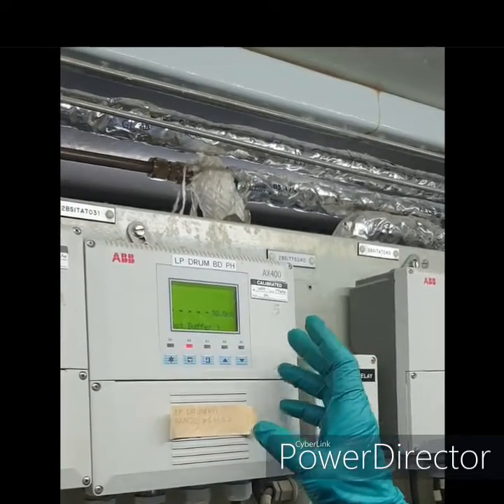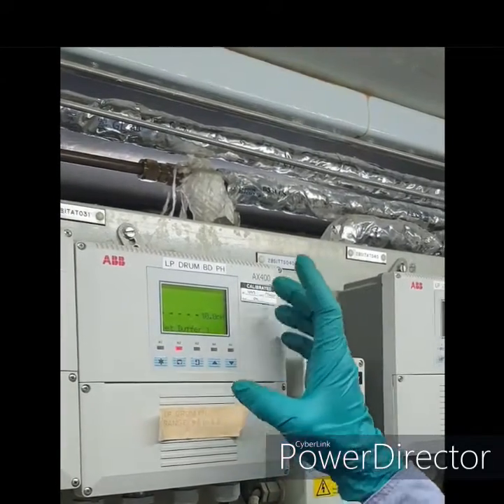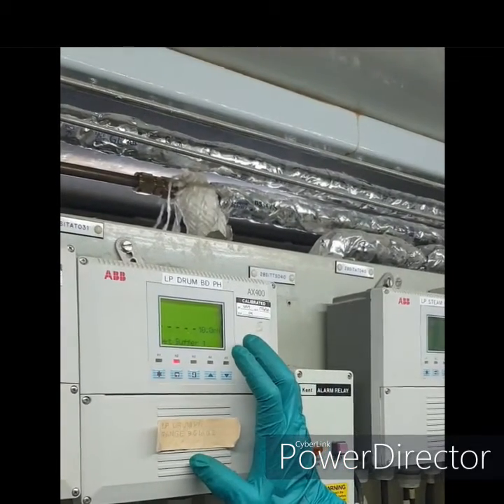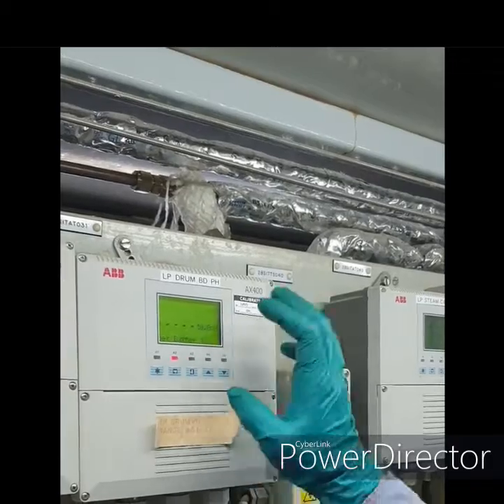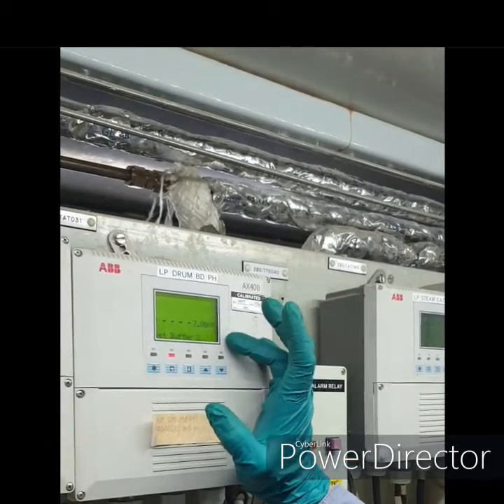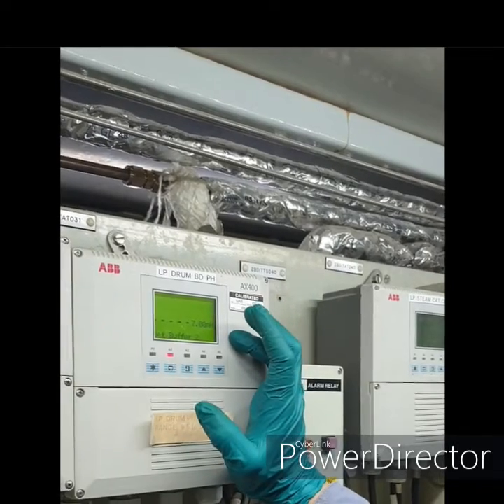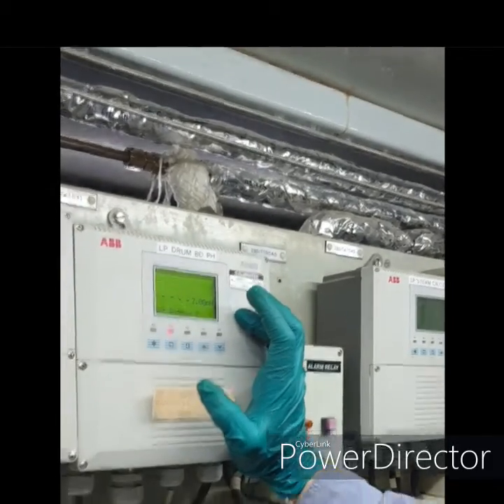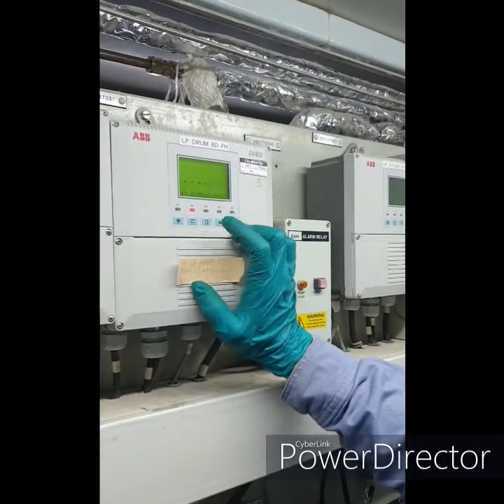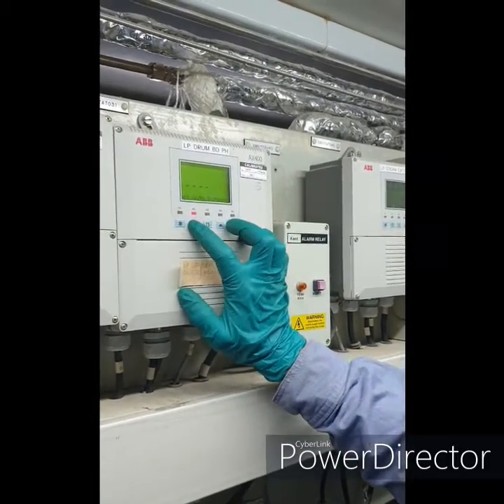We will set the pH solution for buffer 1. At this time we are using 10 pH, so buffer 1 is 10 pH. Then buffer 2, we are using 7 pH. So it has already been immersed in the buffer 10. We will set buffer 1 and buffer 2.